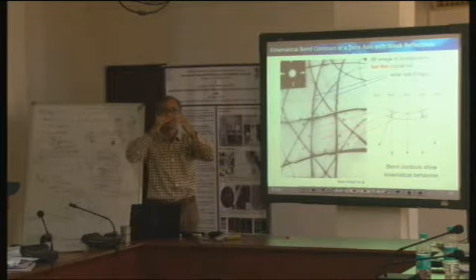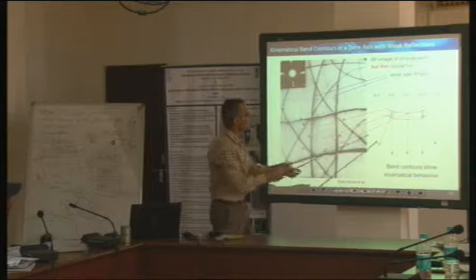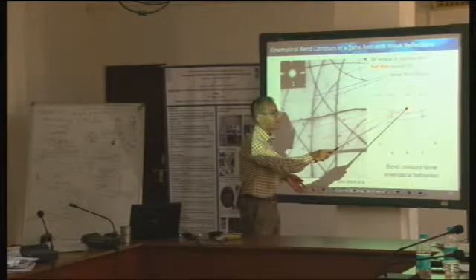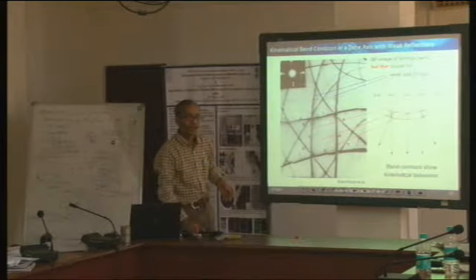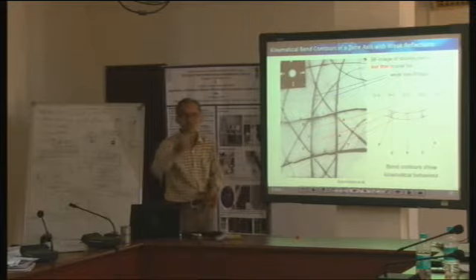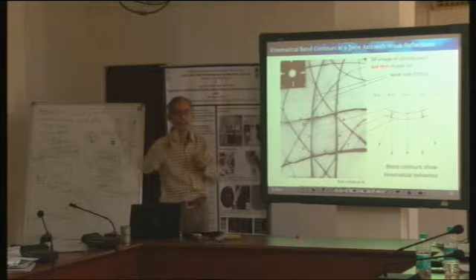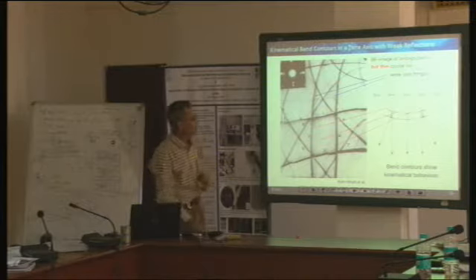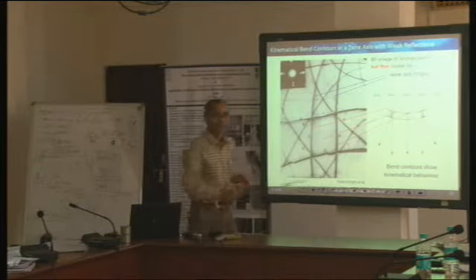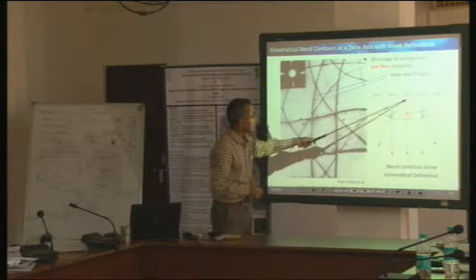See, I have a sample which has been bent slightly like this, and there are lattice planes. The schematic diagram is shown here, in an upward direction. Doesn't matter. Suppose this is my incident beam, and here it doesn't satisfy the Bragg diffraction condition. Just make an assumption that in my Bragg diffraction equation, the angle for satisfying the correct Bragg diffraction condition is 2 degrees, and here it is, for example, 1 degree, and the incident beam is there, like this.